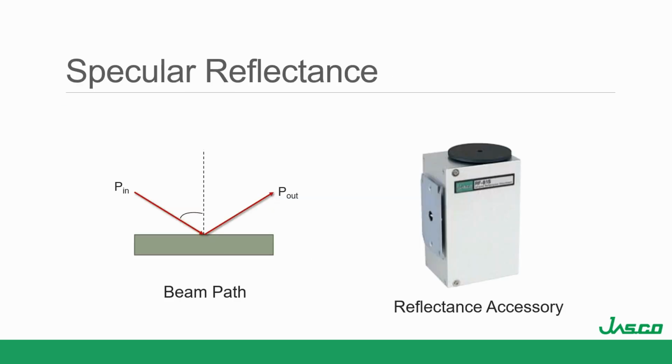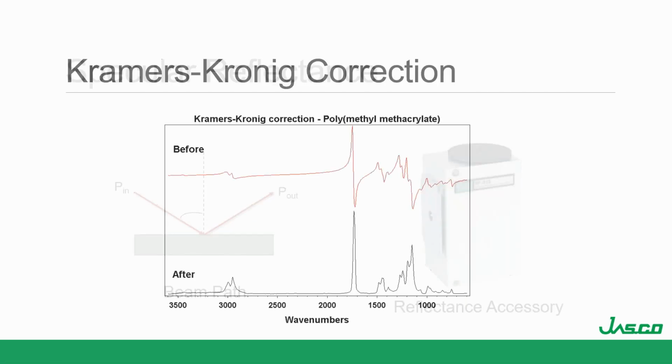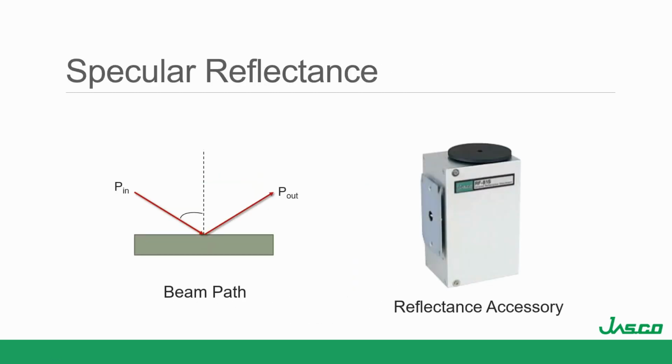All right, so next we'll talk about specular reflectance. With specular reflectance, you have light simply bouncing onto the sample and then back off again. Its incident angle is usually 30 to 60 degrees. This is an example of an accessory. Specular reflectance is really good for coatings on things like Coke can lining. You can do specular reflectance because it's a polymer that's on a metal. So if you have a polymer on a metal, it works really well. It will work with other samples as well.